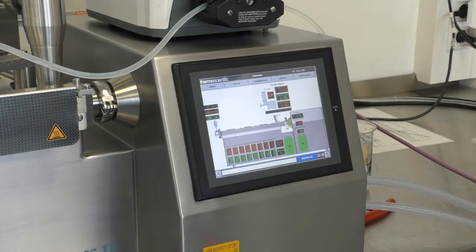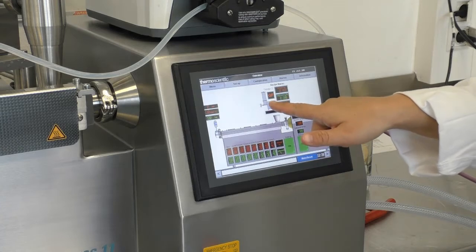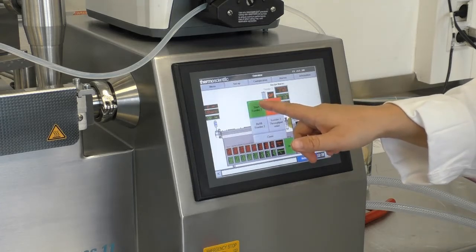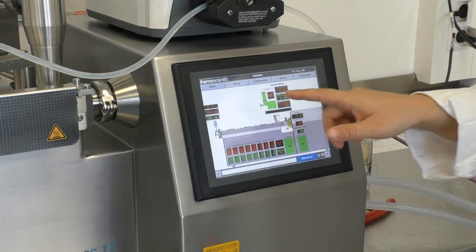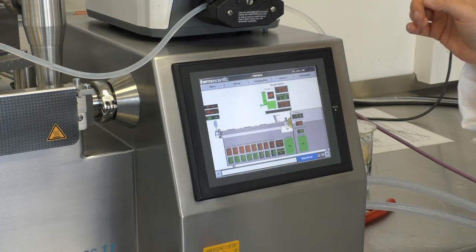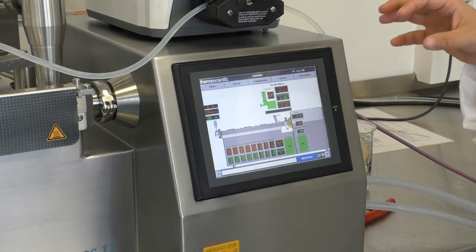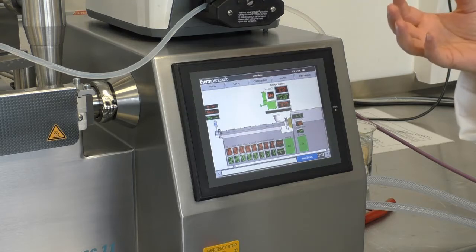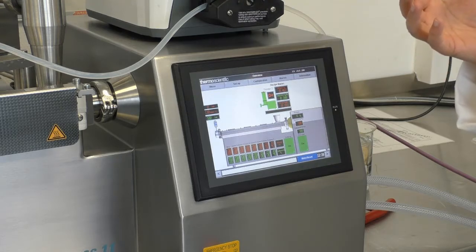Now, as the next step, now that we have water inside the extruder, I will start the solid feeding at a very low feed rate, at 200 gram per hour, while the water is feeding at 400 milliliter per hour. Now I wait until solid with water is coming out of the die, and then I will adjust all the process settings to the range where I want them to be.